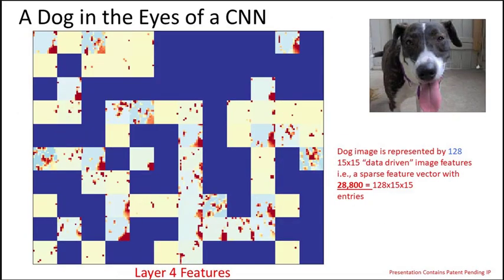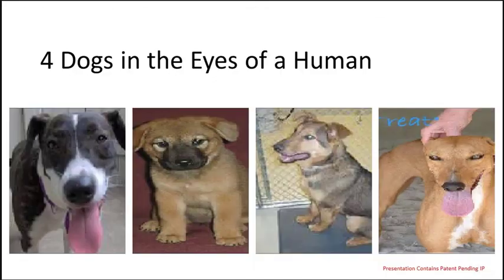But the end goal is really to transform an image into a high-dimensional hyperspectral image. So each of these patches is a new activation image, and this is what the computer uses to try to predict what a dog or a cat is. It doesn't use the original input images. It does this series of transformations to form this representation of the dog.